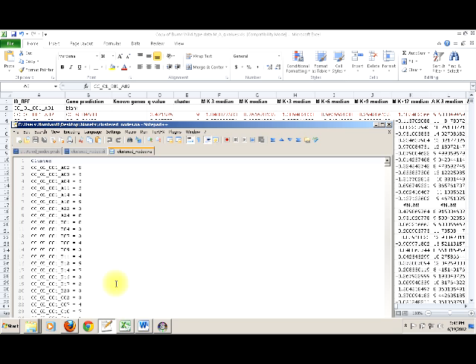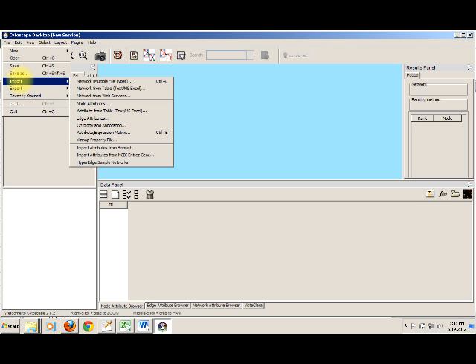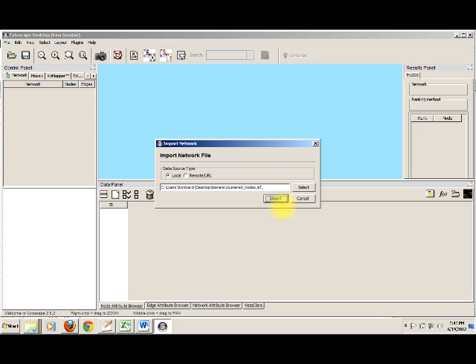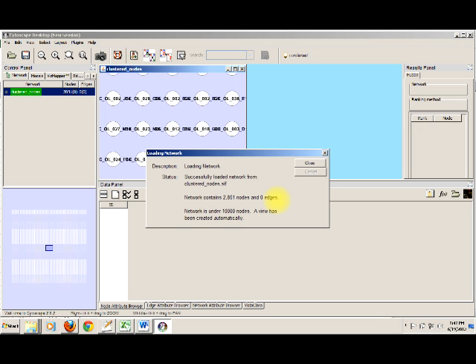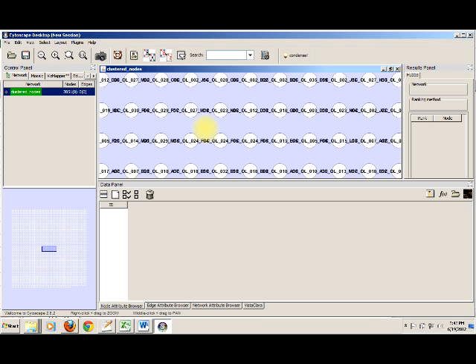Once we have those three files, we jump over to Cytoscape and go through the quick process of importing them. Go to File > Import, starting with the network. We select clusterednodes.sif, open it, and import. Cytoscape gives a feedback message about what it imported. When it starts, it'll be really boring — just a bunch of nodes with no links and no real data associated with them. Don't worry, we're going to change that.